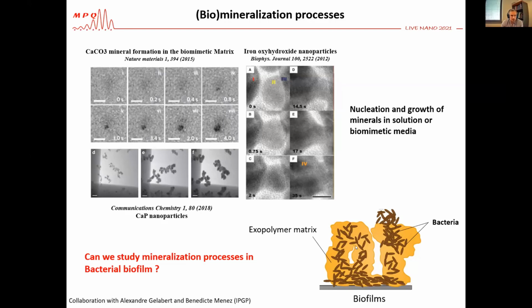And so far in the liquid phase TEM community, there has been a lot of work on the nucleation and growth of minerals, exactly as in solution, like I showed you for the case of gold. You can study different types of mineral formation. But there has been some work also in biomimetic media by adding some polymers that are generated by bacteria in the exopolymer matrix.